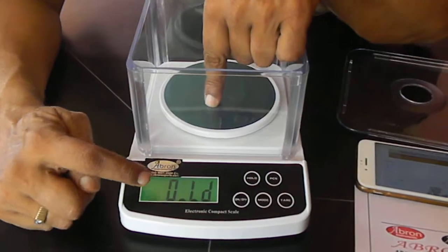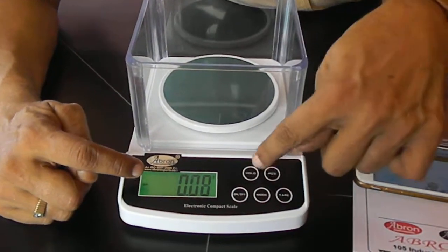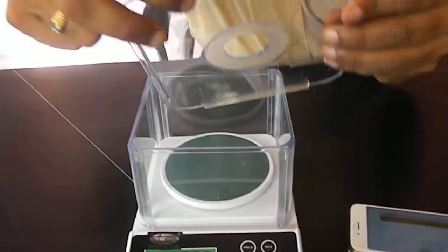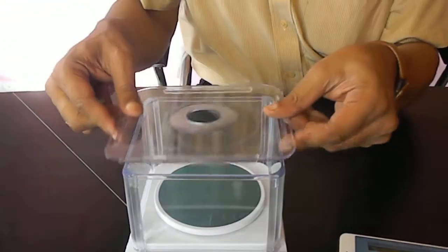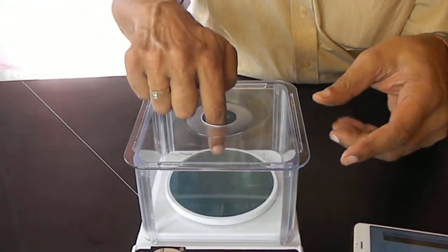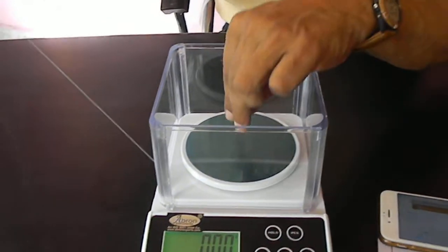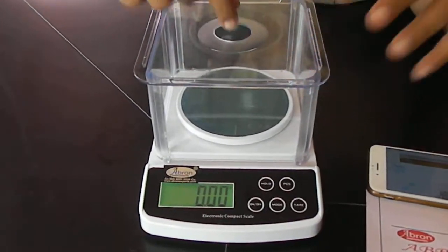This weight comes 500g. The model is there. This top lid has a notch here and you can put on top. It has a hole. You can put a sample directly or through the hole.